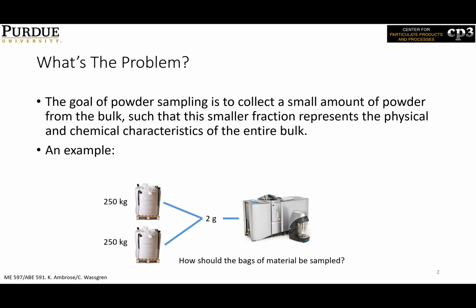Again, keep in mind that the powder may have segregated during filling, transport, and handling. So scooping from the top may not be the best approach. So through this lecture on sampling, we will go through some of the best strategies to sample the powders.